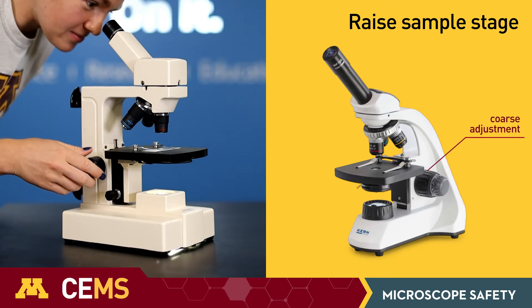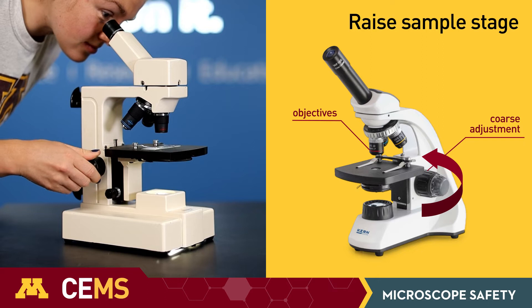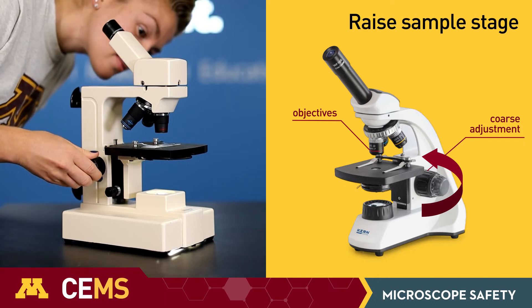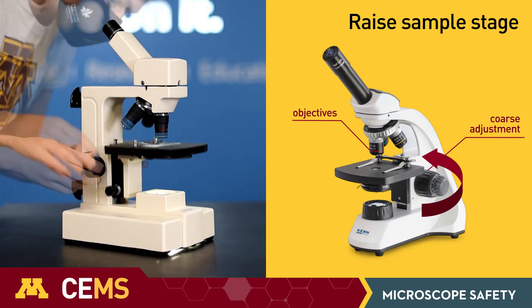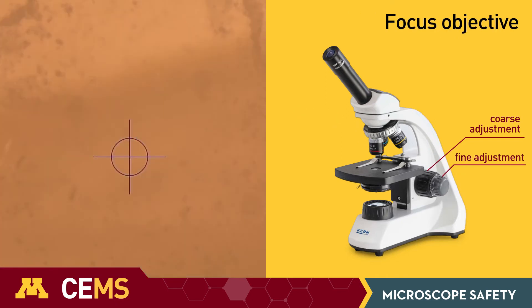When focusing your sample, you want to start by bringing the sample stage as close to the objective as possible without touching it. You can look from the side to make sure that you don't touch the objective. Then slowly lower the sample stage while looking through the eyepiece until the sample is in focus.